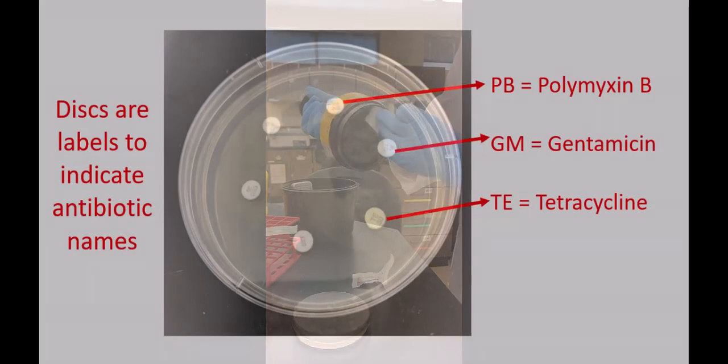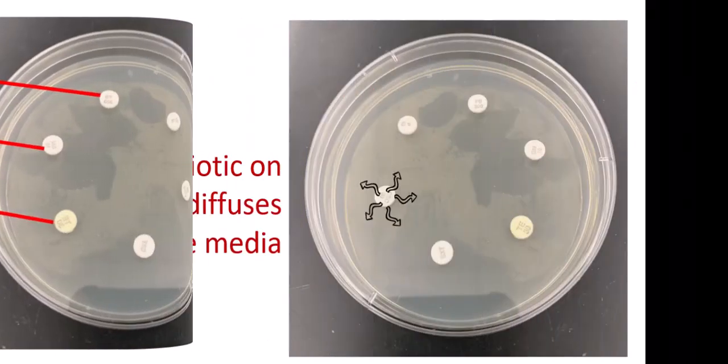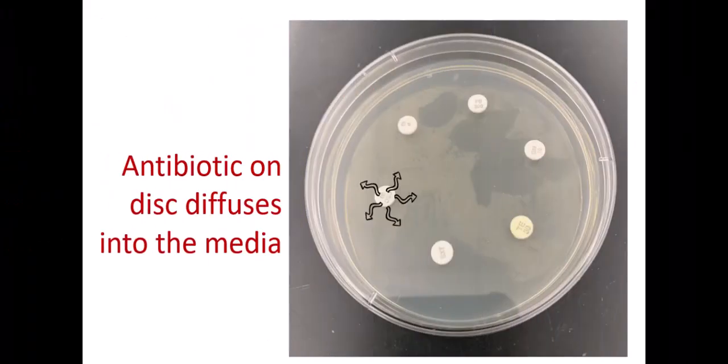Note that each disc has letters on it. This indicates the name of the antibiotic on that disc. When those discs are placed on the plate, immediately water is absorbed into the disc from the agar, and that antimicrobial agent begins to diffuse into the surrounding agar.